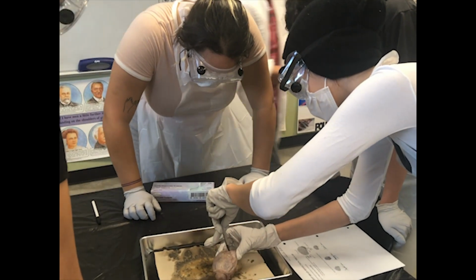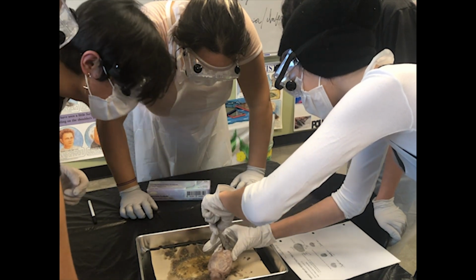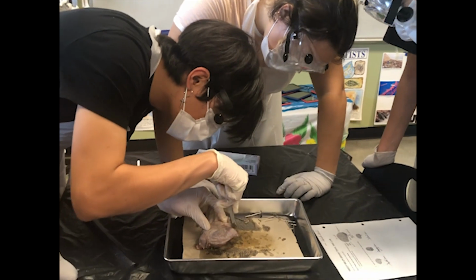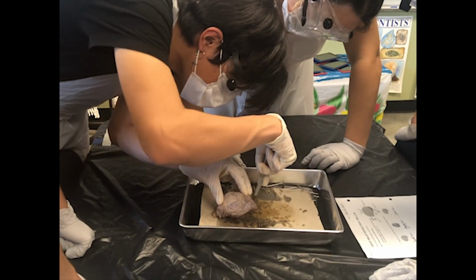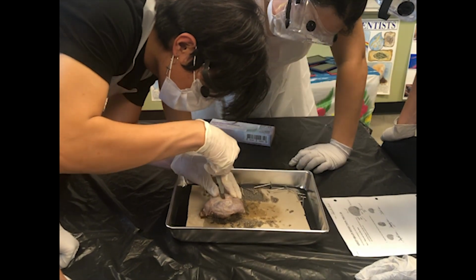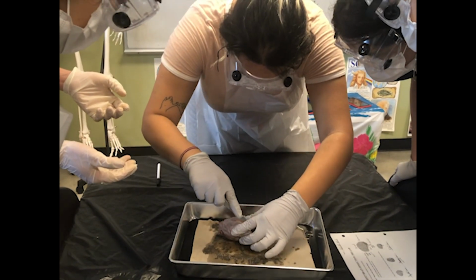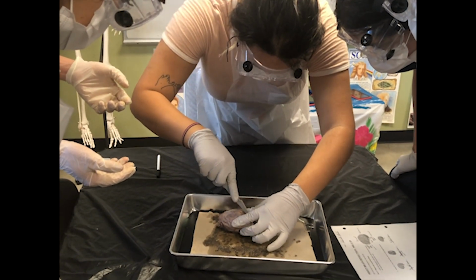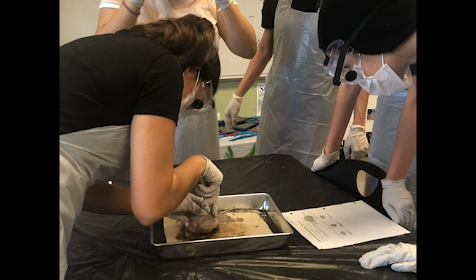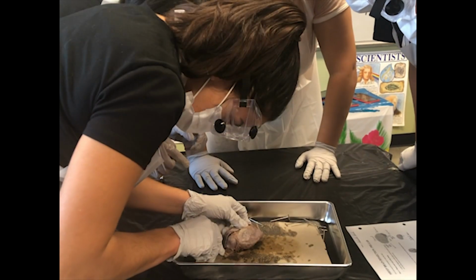Okay, I'm going all the way up for you guys. No, you start with the whole blade and then you progressively go to the tip. And yeah, keep doing that. Trust me. Guys, you gotta think about an even cut. Remember, two hemispheres. Cut the brain, you know what I mean? Now forward it. Yeah, just apply pressure. Yeah, like that, all the way.